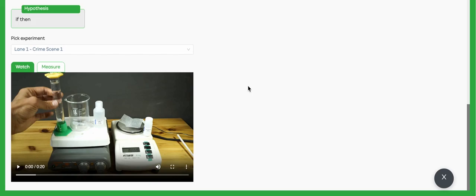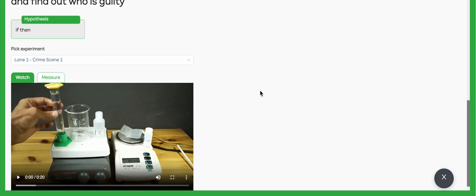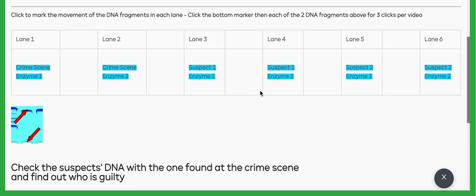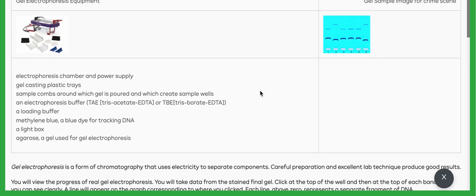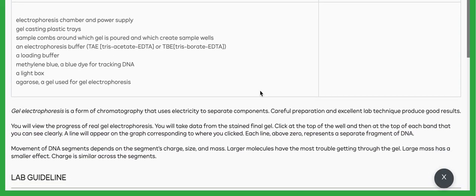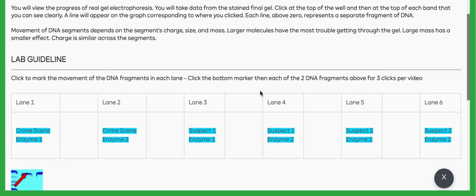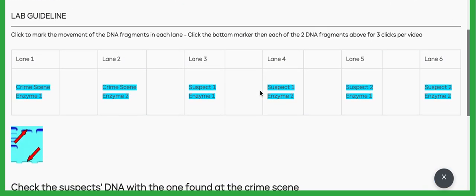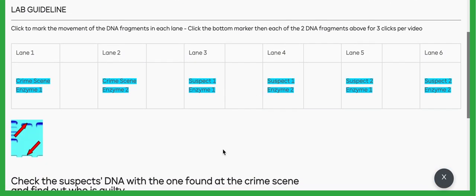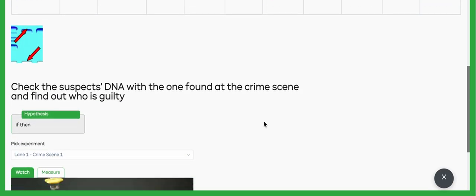Up above is going to be a description of the lab and then a guideline as to what your measurements are. In this case, you've got six different lanes you're going to measure from: two from the crime scene, two for suspect one, and two for suspect two.